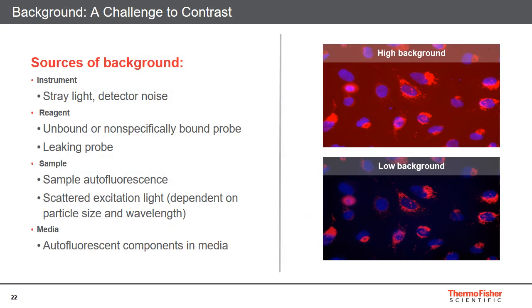We'll move on now into a different category. Instead of looking at how to label and retain and preserve signal, what I'd like to spend a little bit of time talking about is the other side of imaging, which is background, right? So everything that we do in imaging is really aimed at enhancing our signal while lowering the background in order to have the best contrast, not only for visually appealing images, but for something that we can actually quantify and segment and get some type of valuable information out of.